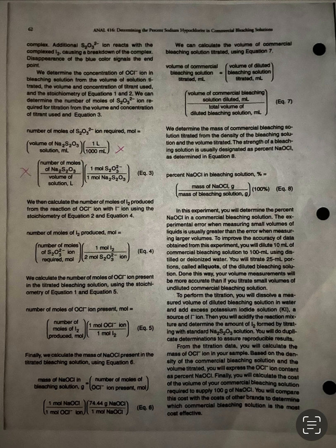This number is from equation 5. Then you use your stoichiometry where you know for each mole of sodium hypochlorite, you have 1 mole of hypochlorite ion. And then the molecular mass of sodium hypochlorite. This is the mass that you would be finding from your periodic table.